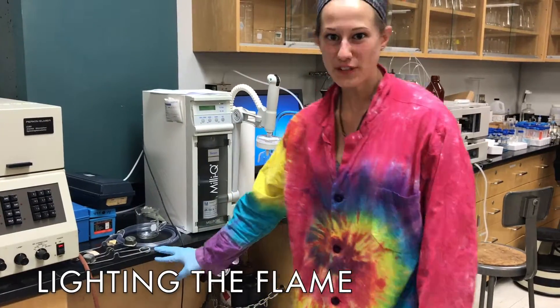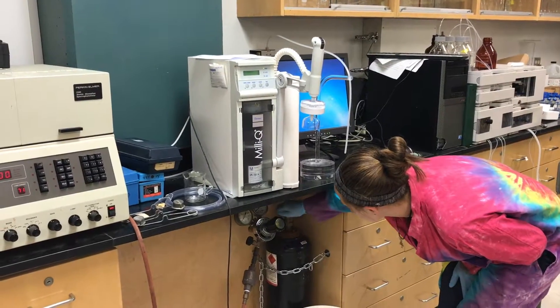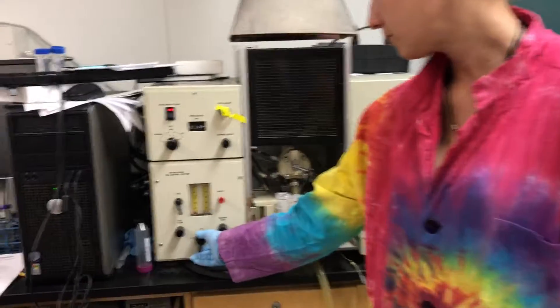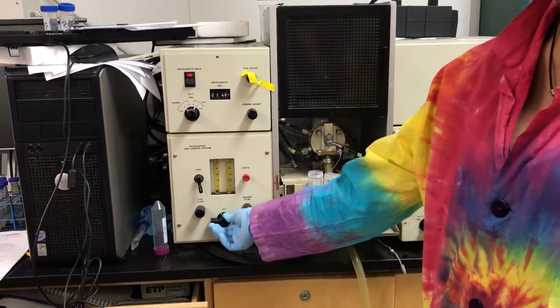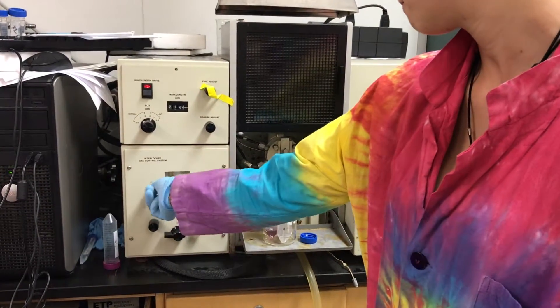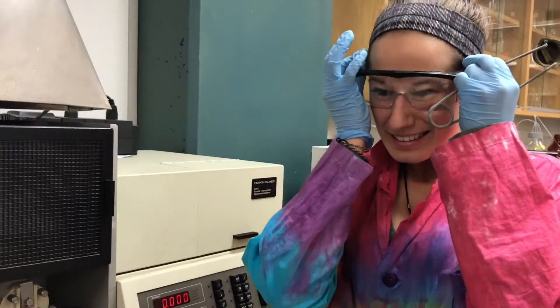To start the flame, open the valve to the acetylene tank. Come over here. Turn the air to on, which is our oxidant, atmospheric oxygen. Turn on the fuel valve, and then ignite the flame. And don't forget your safety glasses.